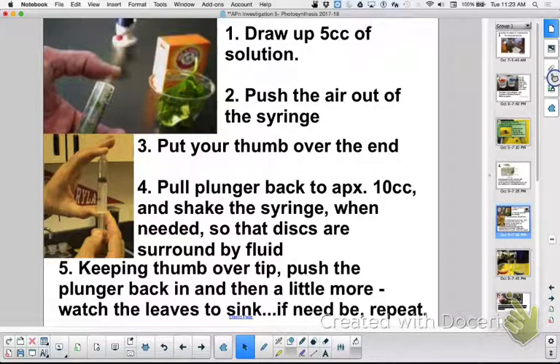Now, the other thing you're going to want to do is get the largest beaker you have in your sink, and you want to take that water, and when you do your experiment, this one would be full of water and disc too. You want to have this here so it absorbs, the water acts as a heat sink, and it absorbs the heat, so you don't end up making that a variable nor cooking your leaves, okay? Because it's not wilted spinach lab, okay?